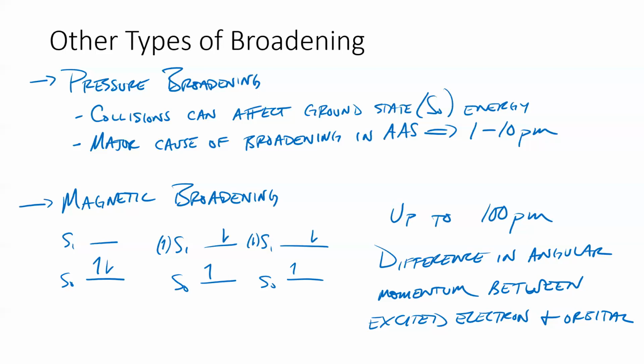Based on the direction of that magnetic field, you're going to align those orbitals. If you do that, then you'll only get one or the other. You won't get both, and so you won't have a broader line. You'll narrow down your line. So that's one way of doing it. It's called Zeeman correction if you're particularly interested. Our book does talk about it a little bit.